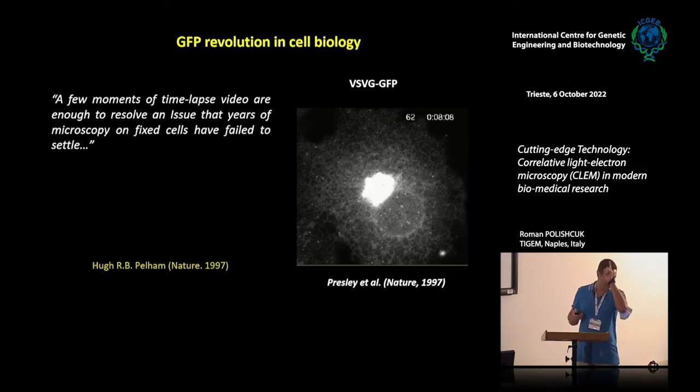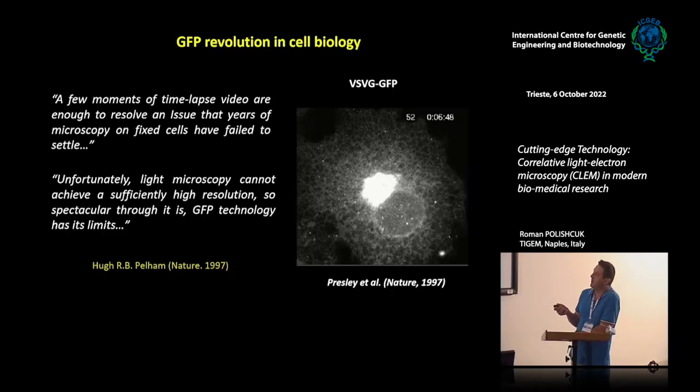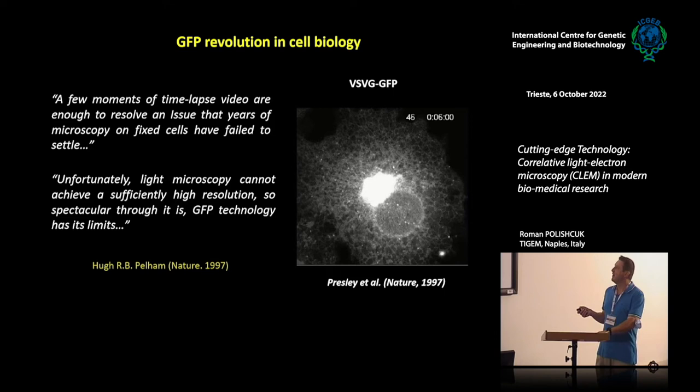However, the same News and Views from Hugh said that, unfortunately, light microscopy cannot achieve sufficiently high resolution, so spectacular though it is, GFP technology has its limits, because nobody knows how these structures look under the electron microscope, because the resolution is not enough.